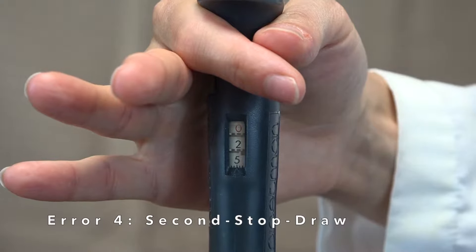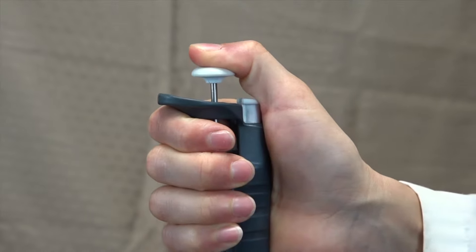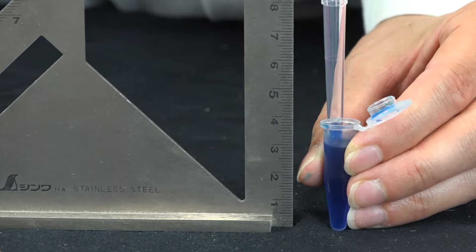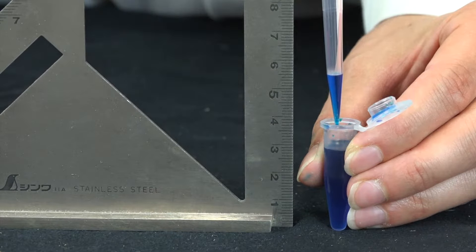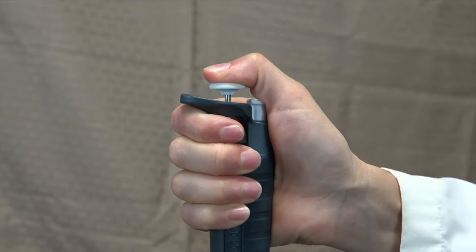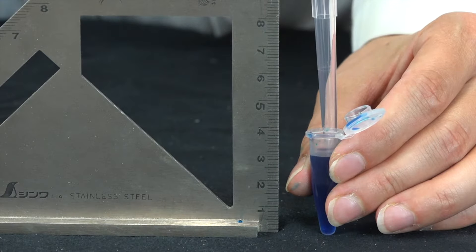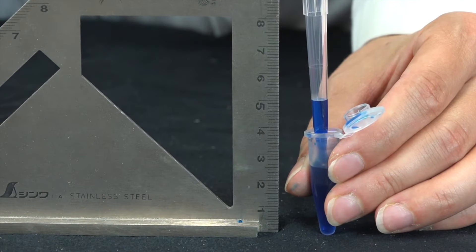I've set this pipette to 250 µL. If you pipette properly by pushing to the first stop, you draw up exactly 250 µL. If instead you push all the way to the second stop before drawing a liquid, you draw up much more than 250 µL, in this case around 316.